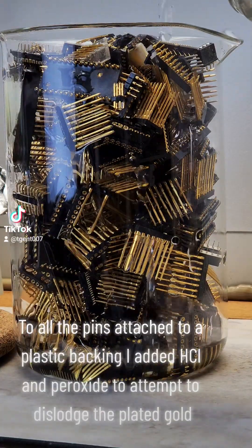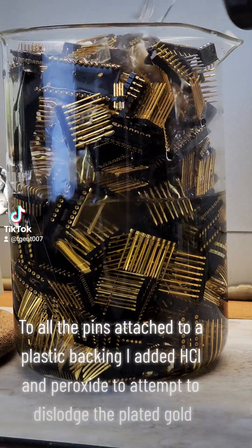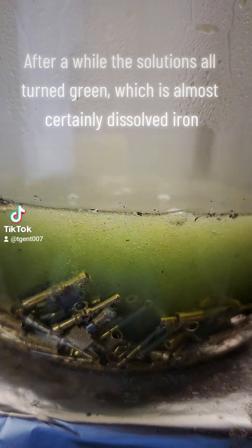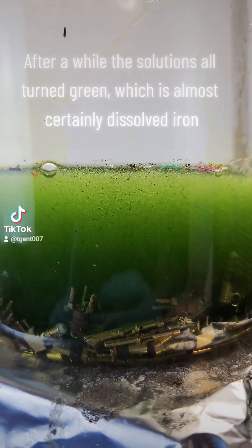To all the pins attached to a plastic backing, I added HCl and peroxide to attempt to dislodge the plated gold. I did the same for these plastic connectors. After a while, the solutions all turn green, which is almost certainly dissolved iron.